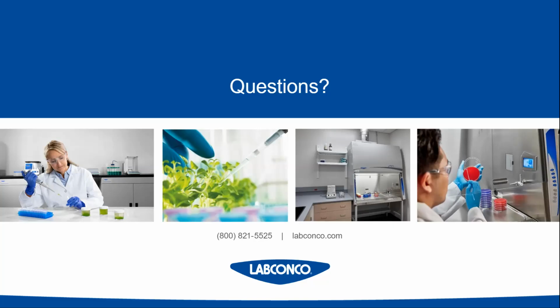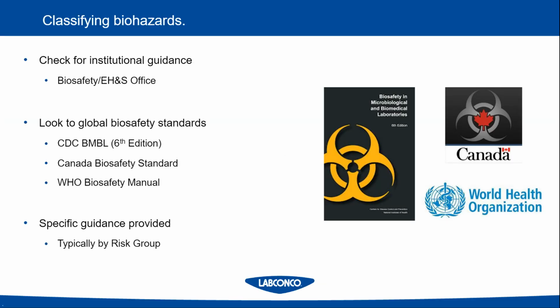Great question. And for that, I'm going to refer you back to one of my introductory slides here, where we can look at the CDC's BMBL. It's hard to suggest a specific biosafety cabinet for fungal pathogens without knowing exactly which pathogen. But in this guide, you can look up the exact pathogen. It'll tell you the types of containment and types of biosafety cabinet. And then you can work with your EH&S or biosafety officer and determine the exact type of biosafety cabinet you would need.